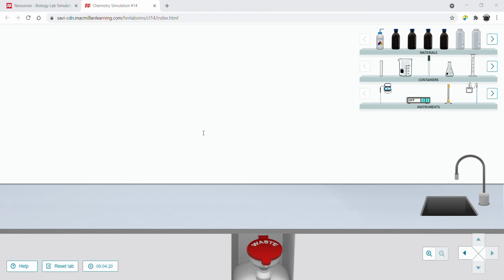So let's go ahead and get started. At the bottom of page 3, you see table 1. This is where you're going to be recording your gas volumes. We'll go ahead and get our equipment. First, we have a test tube, and it wants us to add the pH environment we're studying. We're going to do this one at a time. And then the peroxide.